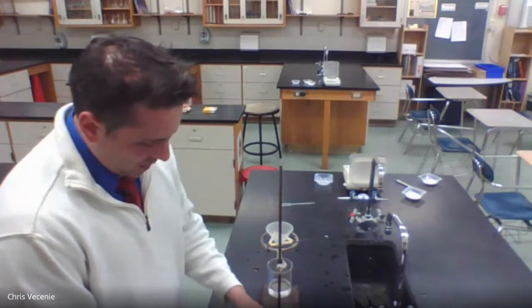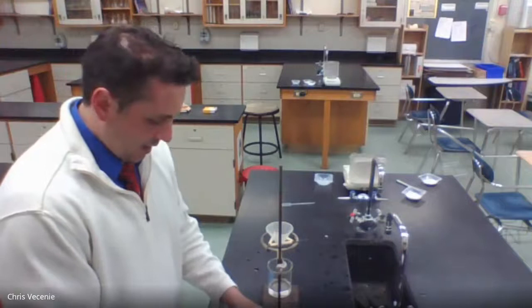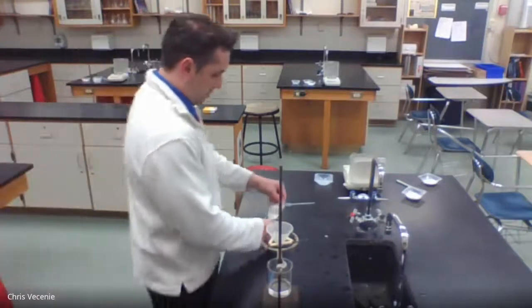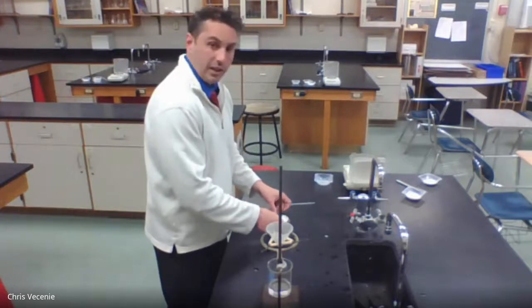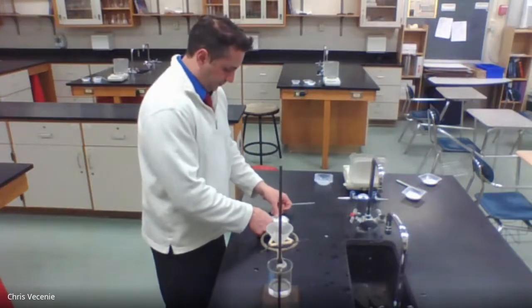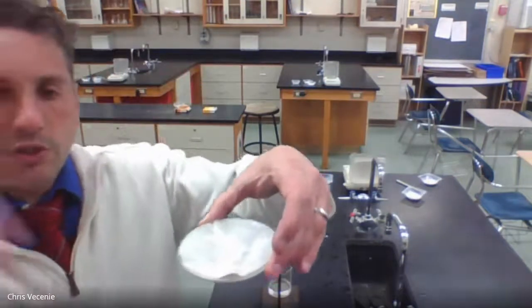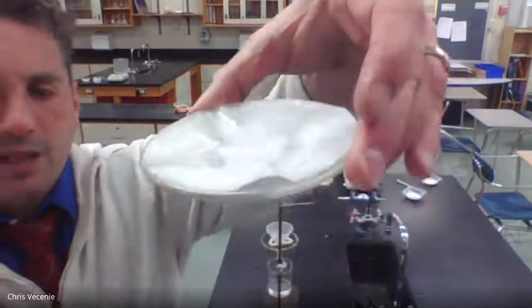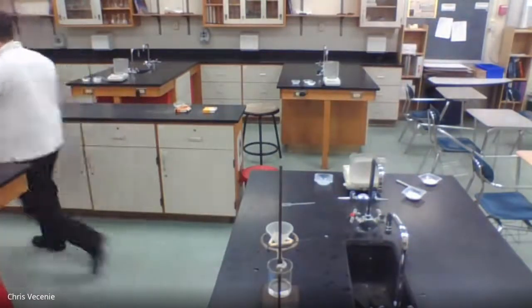So the key to this part is opening it up so that it is facing the seal. Okay. And if I do that, this is what you're looking at. All right, so I'm going to take that into the bag, and I'm going to put it in the oven.